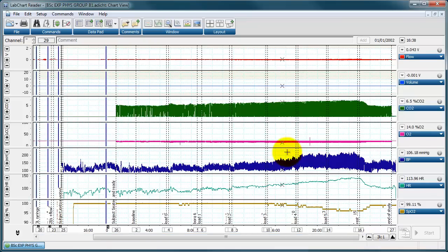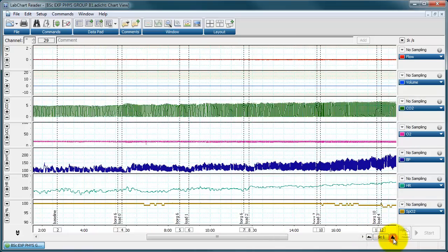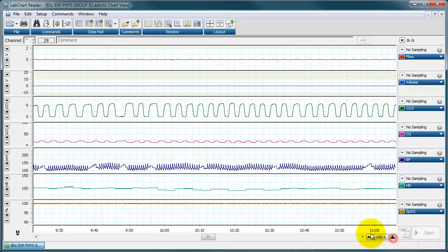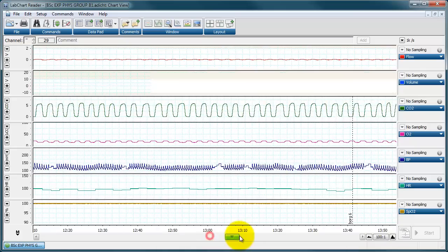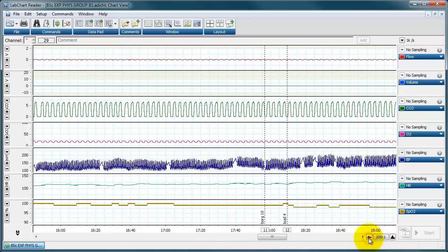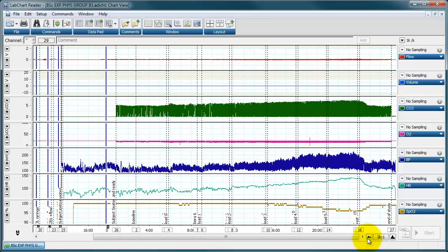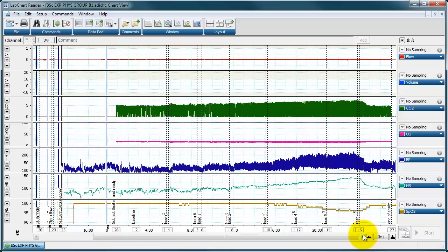You can zoom in on your data much like the full version of LabChart using the two buttons at the bottom. One expands the scaling to zoom in, and the one on the left compresses the scaling to zoom out. This only changes the horizontal scaling, not the vertical scaling of your data.